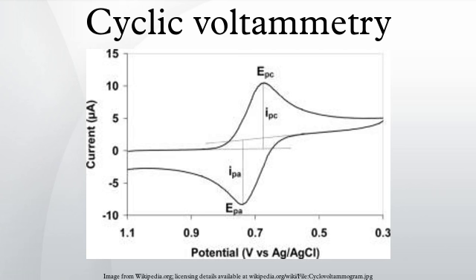In Figure 2, during the initial forward scan, an increasingly reducing potential is applied. Thus the cathodic current will, at least initially, increase over this time period, assuming that there are reducible analytes in the system. At some point after the reduction potential of the analyte is reached, the cathodic current will decrease as the concentration of reducible analyte is depleted.